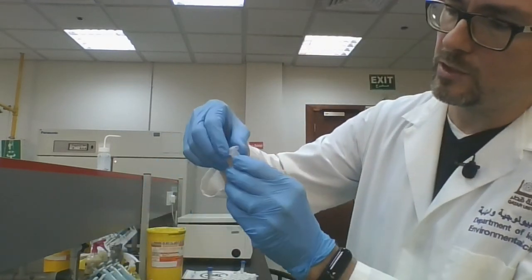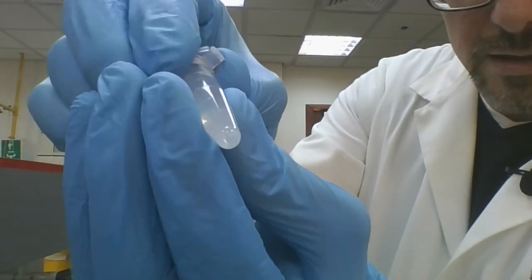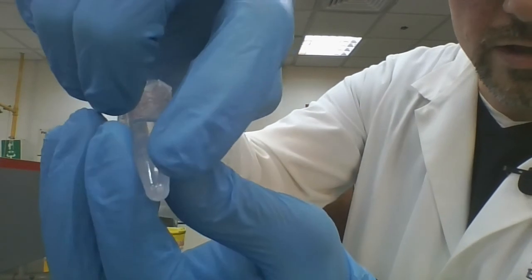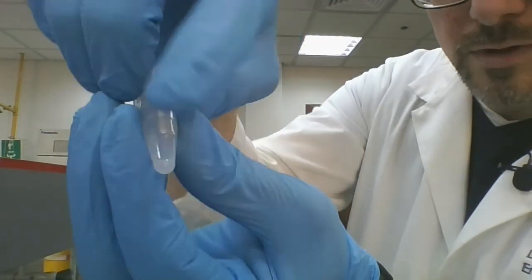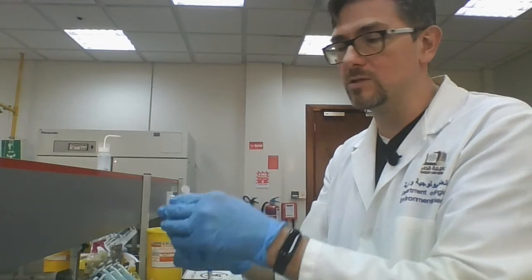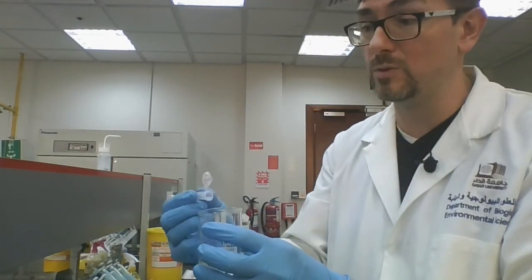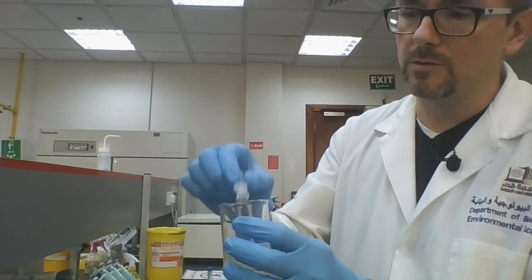We'll take it out. Again, don't expect to see a huge thing, but there is a small pellet at the very bottom where the hinge is. So right around here is where you will have a tiny little white pellet visible. And the only reason you can see it is because there are still impurities in there. You still have some salts dissolved in that pellet, which is why you can see it. That's why it's white. DNA itself, when it's pure, is clear. So you wouldn't see it easily. You still could.